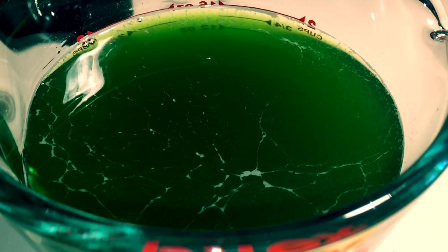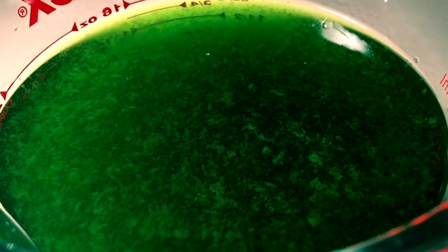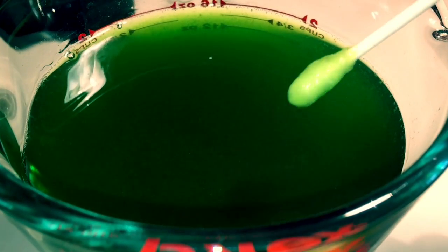Throughout these 3 minutes, you can see a precipitate building up. This precipitate you see is spinach DNA.